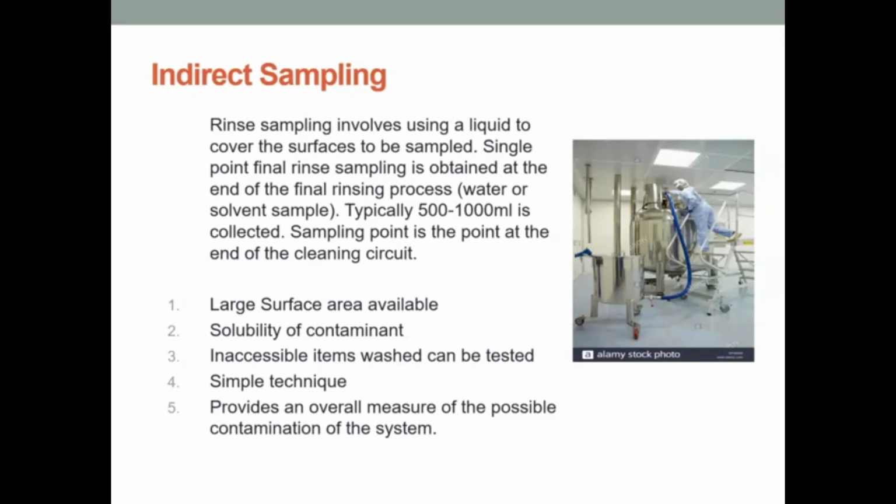The advantages are that a large surface area is available. You need to make sure of the solubility of your contaminant. Inaccessible items that are washed can be tested by doing this, where you can't do direct swabbing. It's a very simple technique, and it provides an overall measure of the possible contamination of the system.